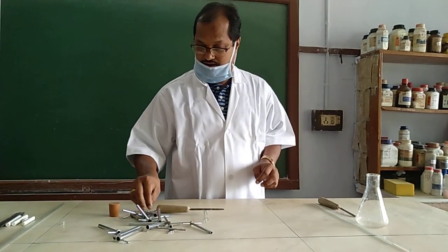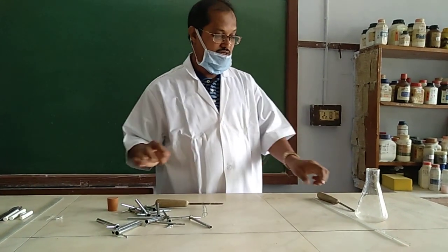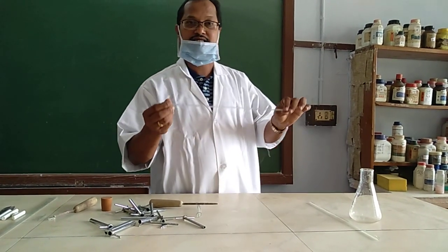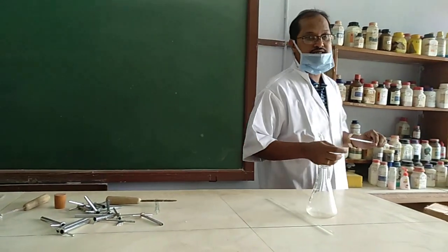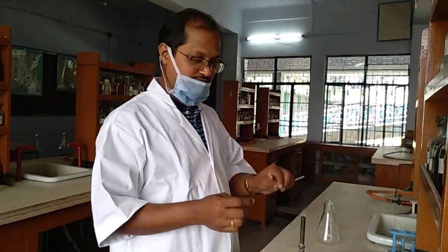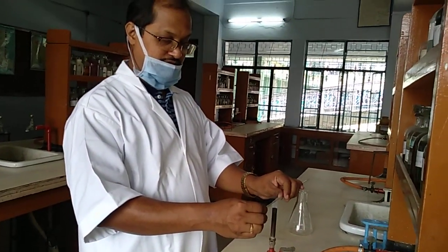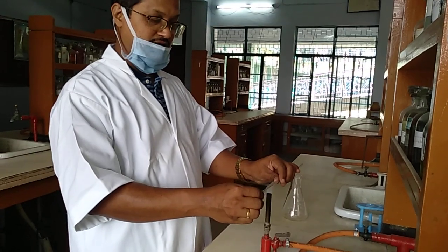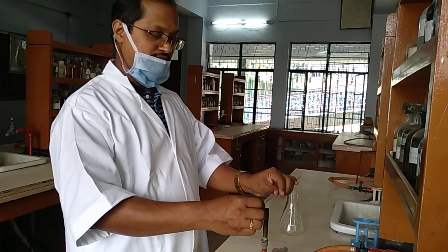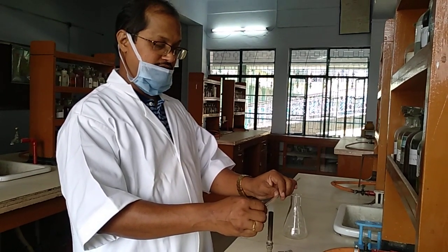Be very careful while doing this, otherwise you can get a scratch on your hand. Now we will start making the jet. First, melt a small section of the glass tube at a little distance. Heat it on the non-luminous flame, and see how it is getting melted.